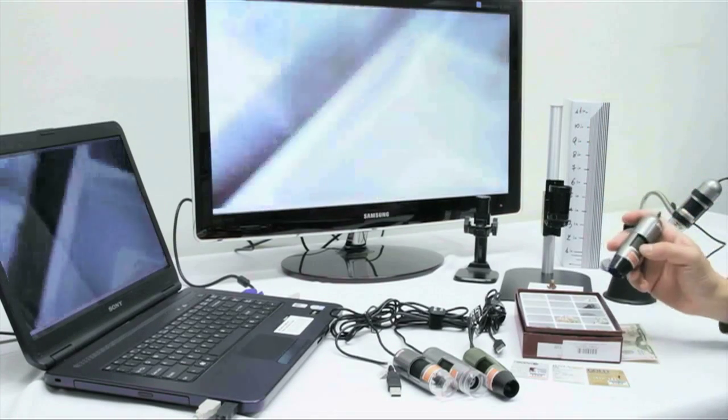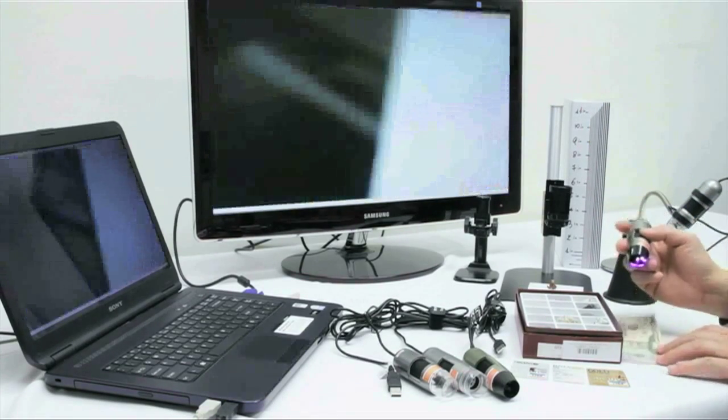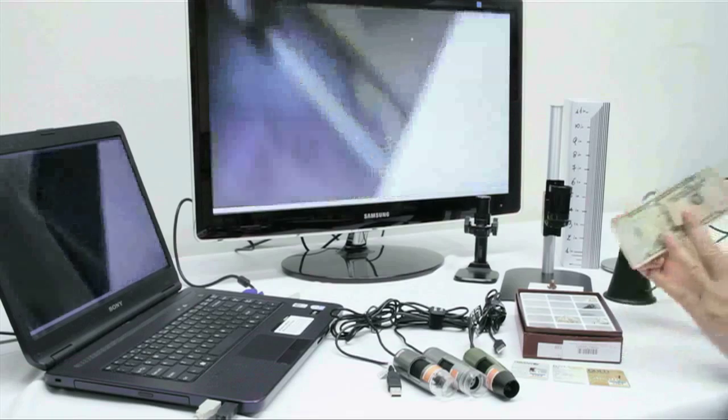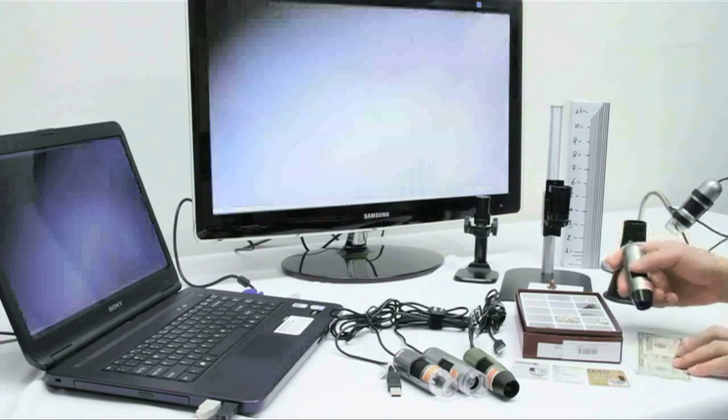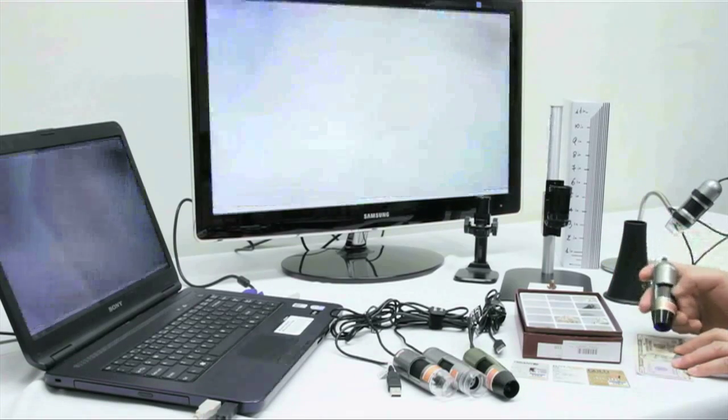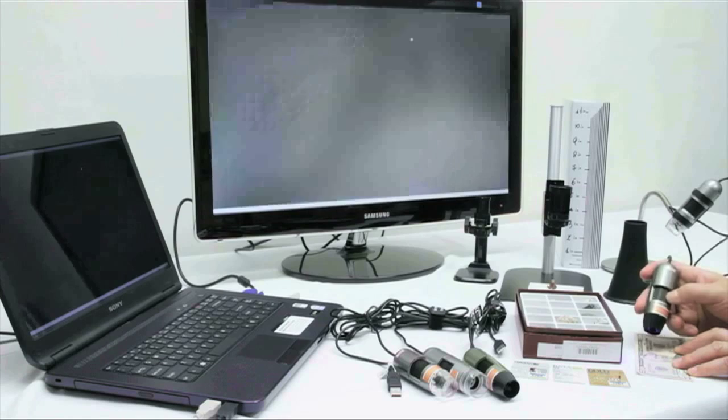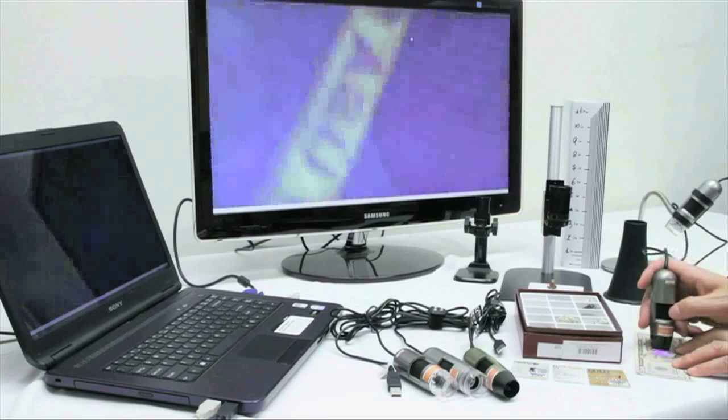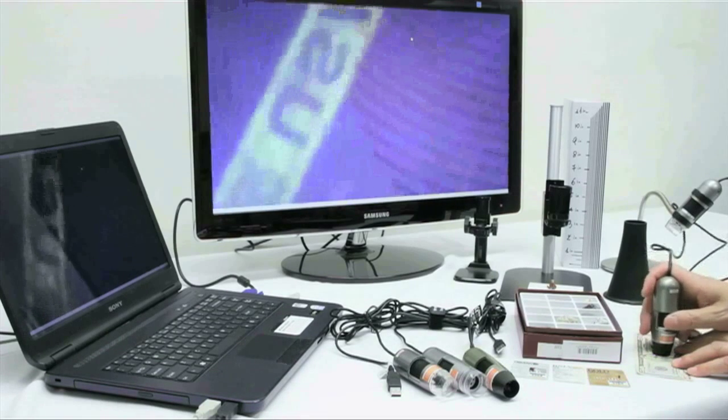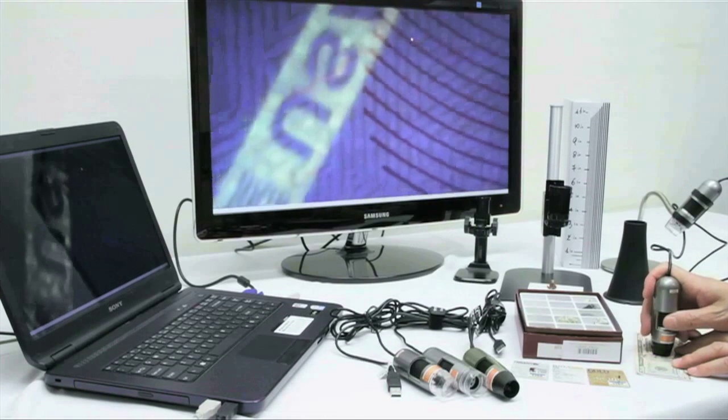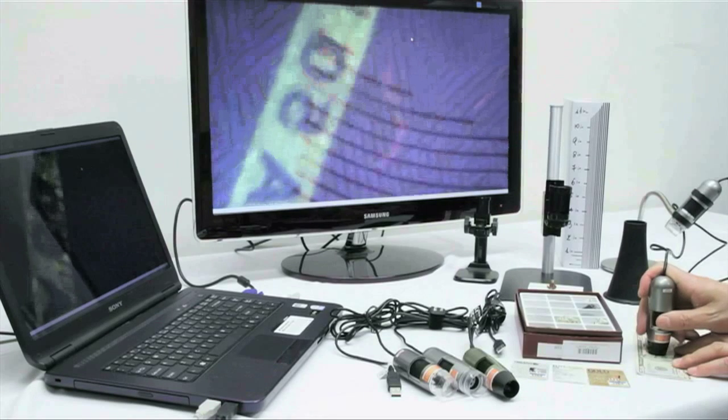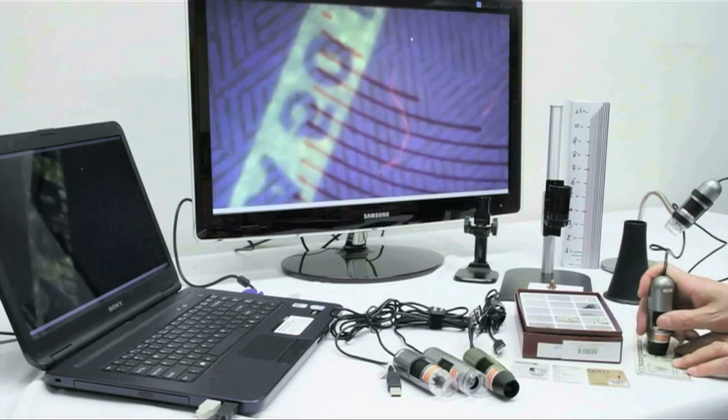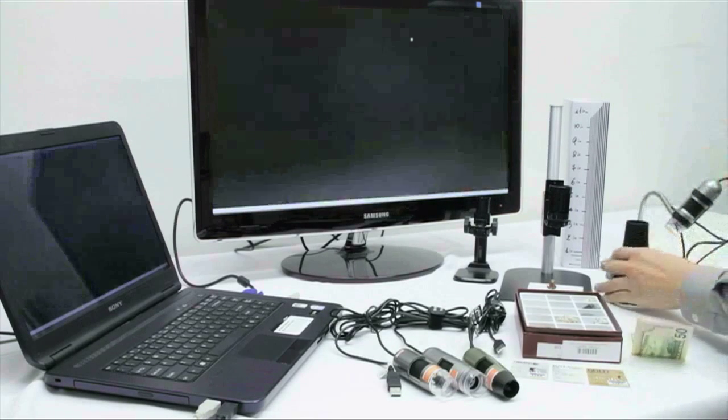This microscope does not have to be confined to a stand, we can use this in a handheld mode. For example, we will take this out and look at a dollar bill. Now we are viewing this bill to start out with a 50x magnification at a zero working distance, so we can actually touch the object and still get it into a good magnification.